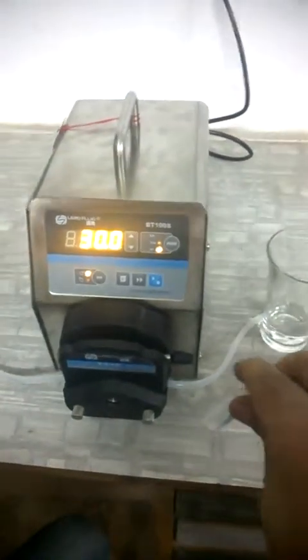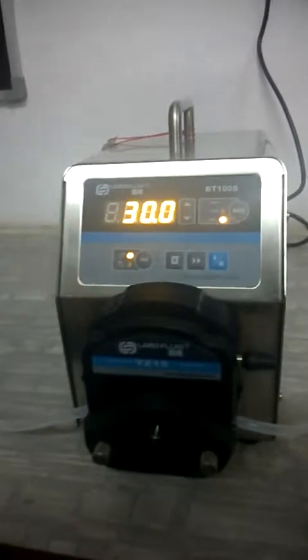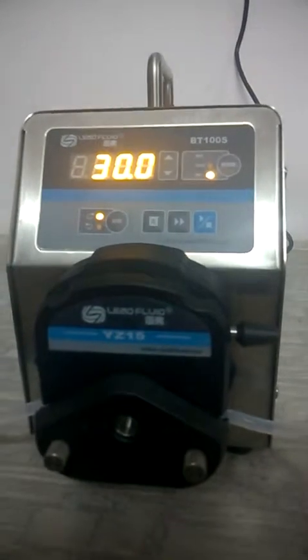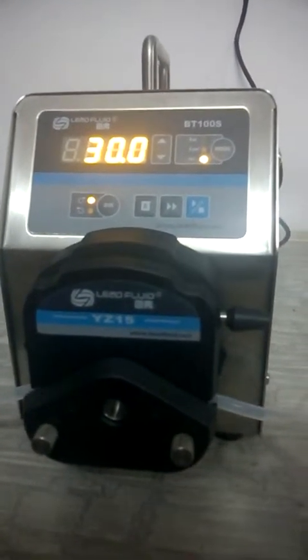I hope this short video helps in understanding and running the machine for the first time. We again thank you for purchasing the Lead Fluid pump, and if you have any problems or queries, please feel free to contact us. Thank you so much.